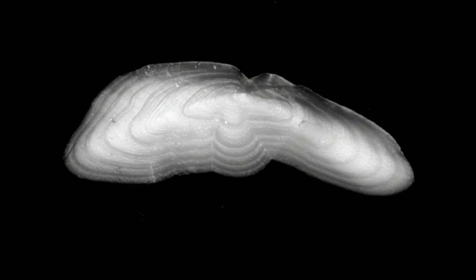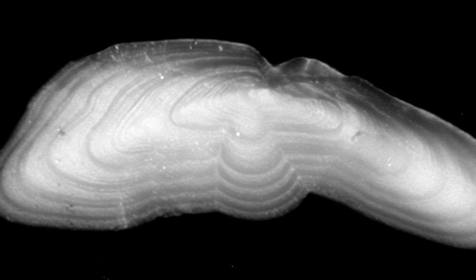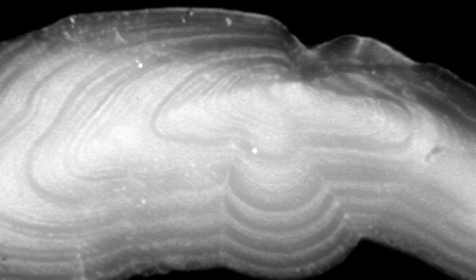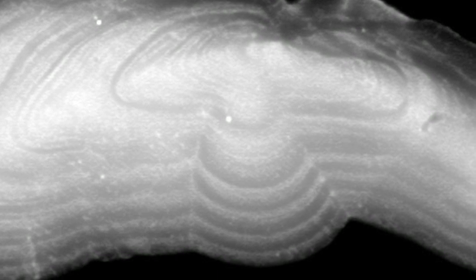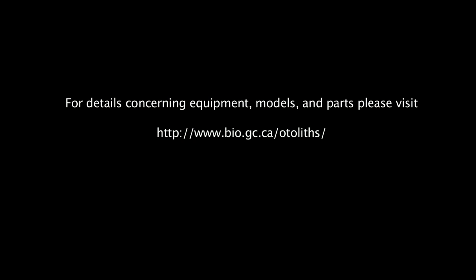The Krylon will take about two days to fully dry, after which the sections are ready for viewing and aging under an image analysis system or microscope. The Krylon coating has the same effect as immersing the sections in liquid, which is to smooth out any surface roughness and to greatly improve the visibility of the growth increments.